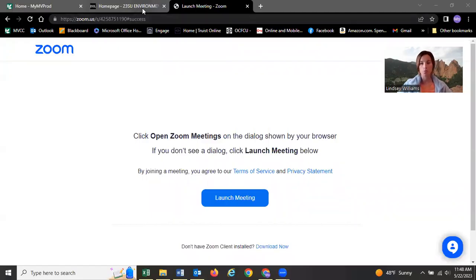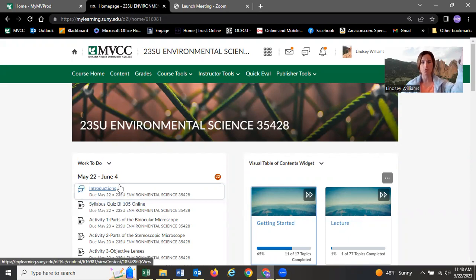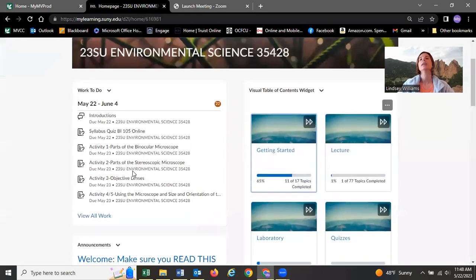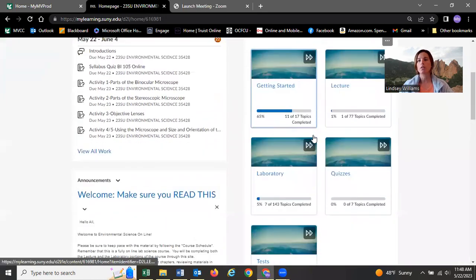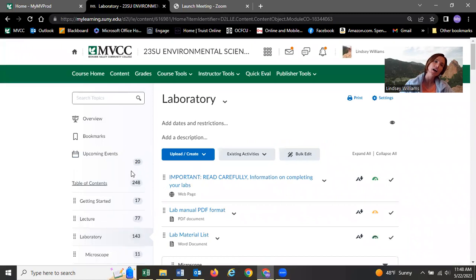Let's go to the home page. So here's your home page. Ignore the dates and stuff. This is for the semester that I'm currently in. Those will be different as semesters go on. But we are going to go right to laboratory. We're going to get started on the microscope. Remember, have patience as things open.